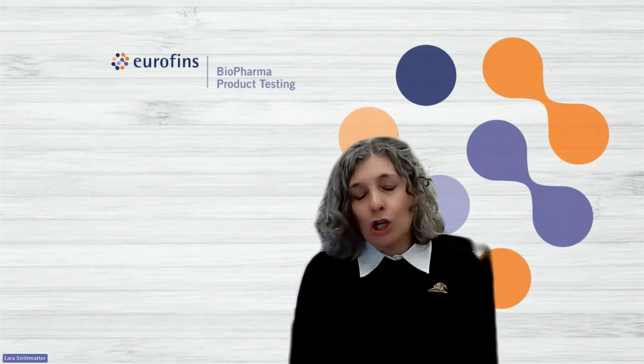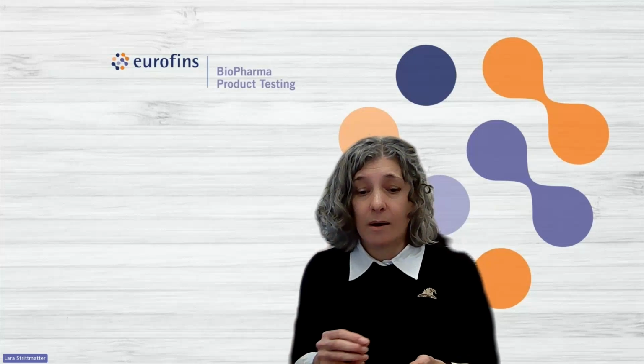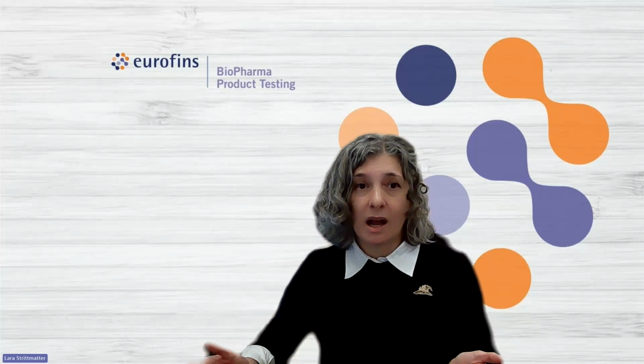And then on the sampling methodology, I just want to point your attention to, we started using an automated imaging method to try to get operator bias out of the mix. So we select the areas at a very low magnification where we cannot see if there are particles present, but we choose the areas based on the integrity of the section itself and if there are no stains or blemishes on them. And then the computer on its own takes the pictures, and then we compose a montage that is made of approximately 100 high-resolution images, and that's where we count the particles.